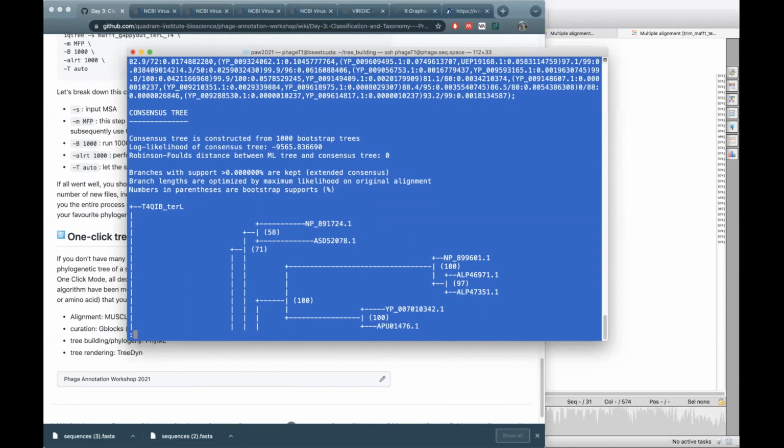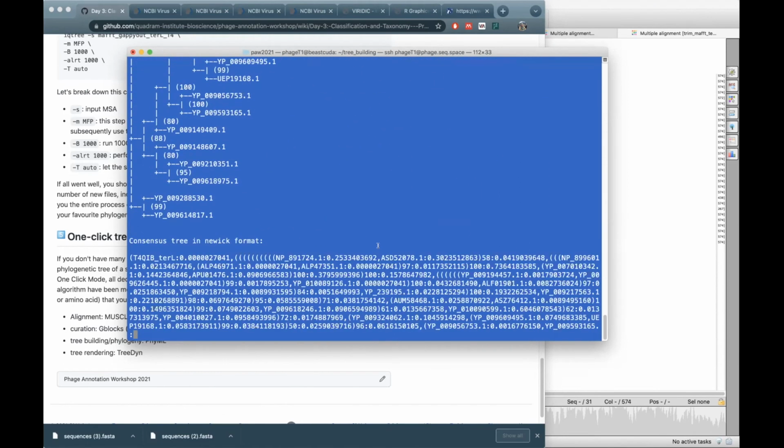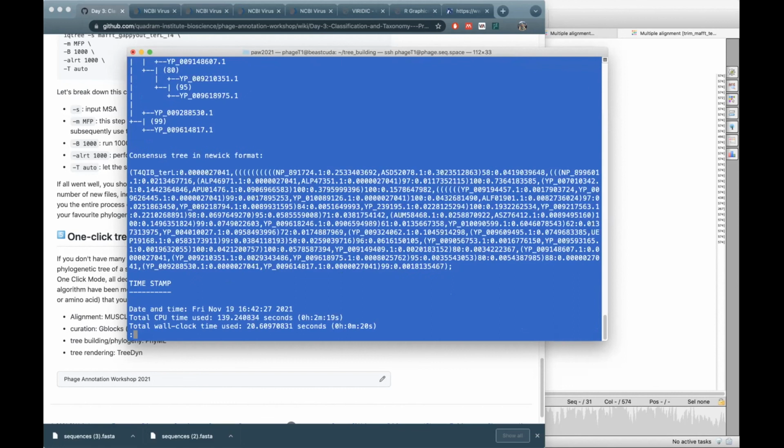Yes, this is the part of the refinement that I briefly mentioned before. So after you make a tree, the question is how strong it is. Of course, you have a result, but how strong it is and how well supported by your data it is. Yeah. Not every bit that was used is as informative as the other. So more or less, this is the process that was done here.